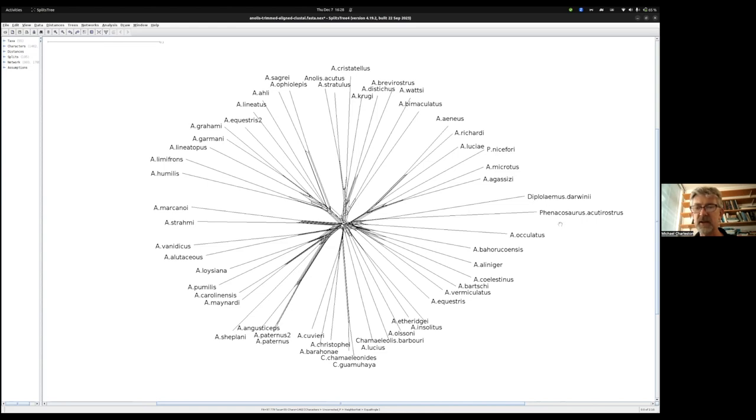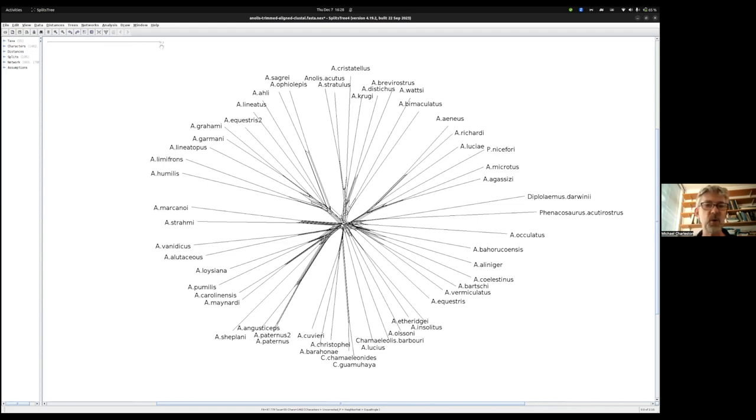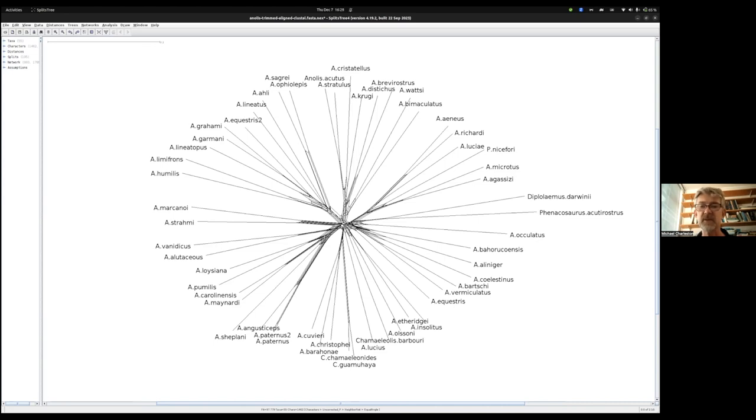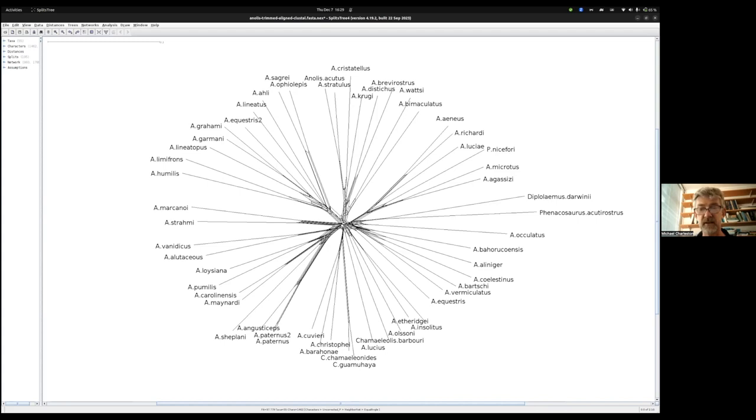If I come back to that scale bar of 0.1, the distance between these two taxa is pretty high. It looks about 0.2, about 20% sequence divergence or difference between the two. That's quite a lot and that's going to make you suspicious that inferring this phylogeny might be tricky.